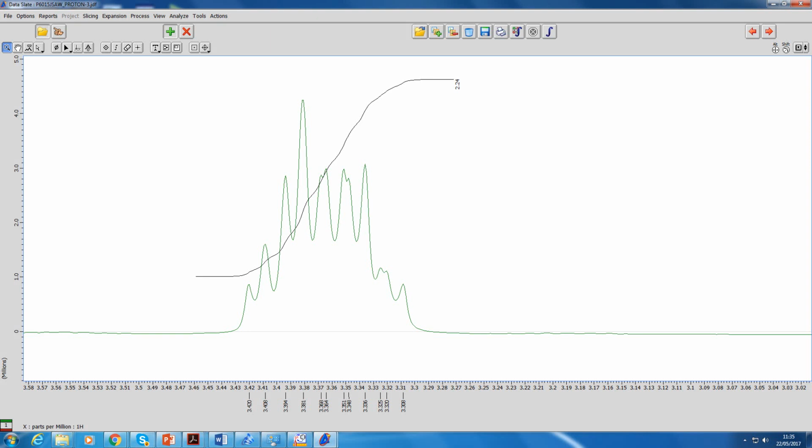Anything else? I think that's everything you probably might want to do. As we say, probably the best way of getting the data off is to do an Alt print screen, do a screen dump to get it off, and you can change colors and things in Microsoft Paint. That's probably the best thing to use.